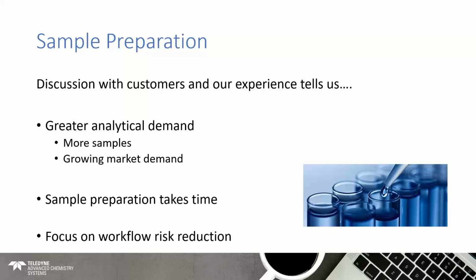Again, to reiterate, what we are hearing from everybody is that sample preparation takes time, and typically more time than you would expect. It's very easy to underestimate just how much time it takes to do the actual sample preparation side of things. There's also a focus at the moment on workflow risk. What we are hearing from people is that where possible, the need to reanalyze samples after they've been run should be avoided.